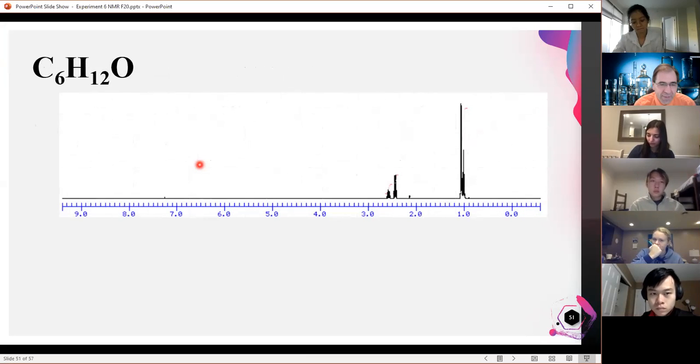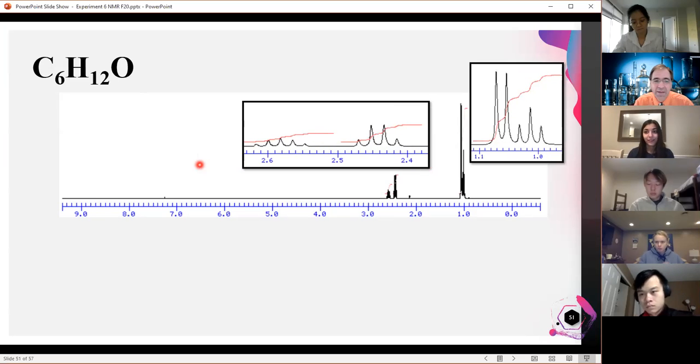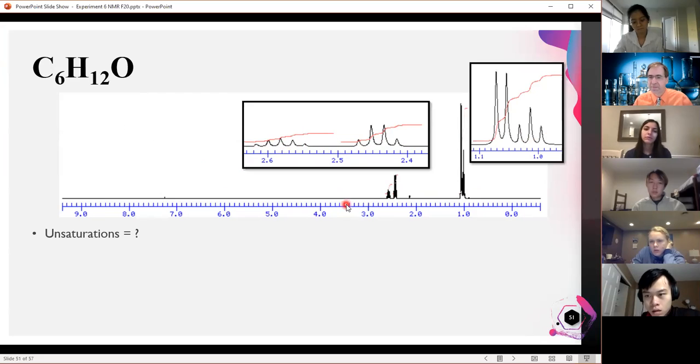All right, so let's look at one. C6H12O. There we go. You guys know what it is yet? Okay, I don't either. Well, okay, I do because I wrote the PowerPoint presentation, but I have to think about it. I have to work through it. For one thing, I need to zoom in and see. A lot of times these are really small, and so we zoom in and we see what we got. So I've got 1, 2, 3, 4, 5, 1, 2, 3, 4. I've got, ooh, this thing here is actually a doublet next to a triplet. All right, so let me calculate my unsaturations, use the formula, comes out to be 1. So I got 1 unsaturation.